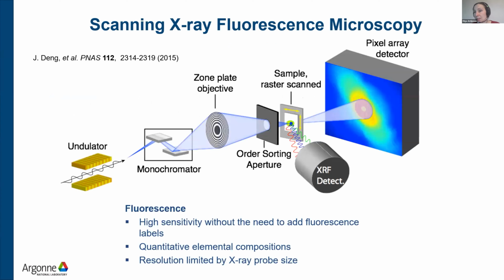So I'm gonna go through techniques which we offer. So first I want to mention X-ray fluorescence microscopy. So we have multiple beamlines which offer this capability with a variety of resolution and sample environments, and with some additional techniques available as well.